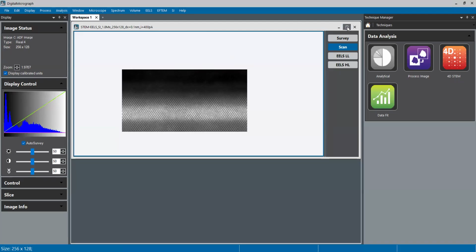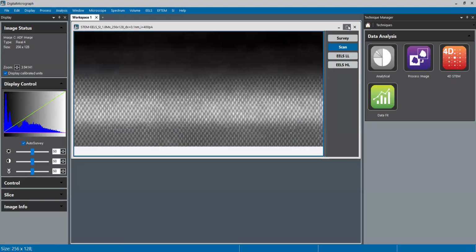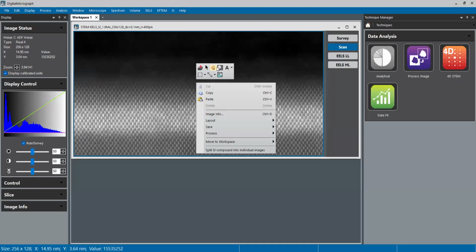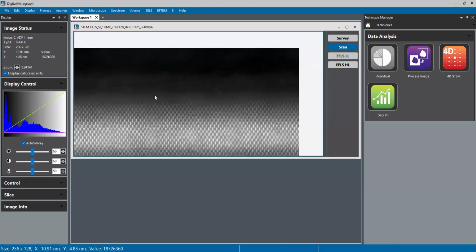If you just do this, it doesn't work. If you do Control L, it doesn't work. If I expand it here and maximize, it doesn't work. So the shortcut here, if you throw this off, is double left click. And there we go. It took me a while to figure that out, but that's how you center if you've dragged it off like that, double left click.